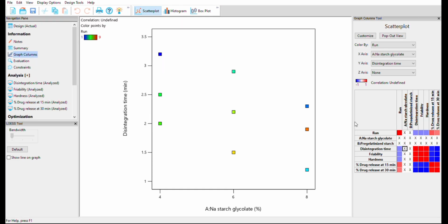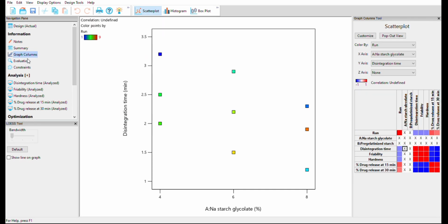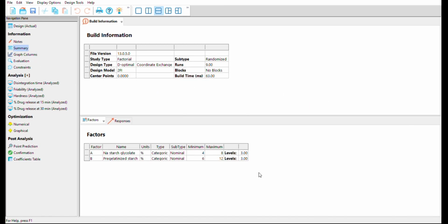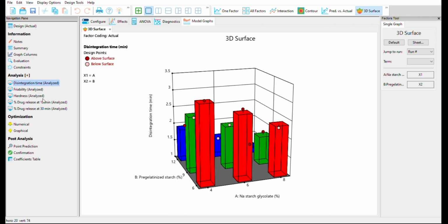And here you can read a lot about the parameters. Okay, whether it is good or bad, whatever it is. Okay, you can also see your summary here. There are a lot of things you can learn. Okay, just go through this. But the main thing is the analysis.